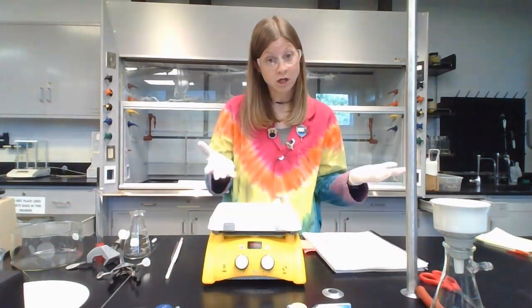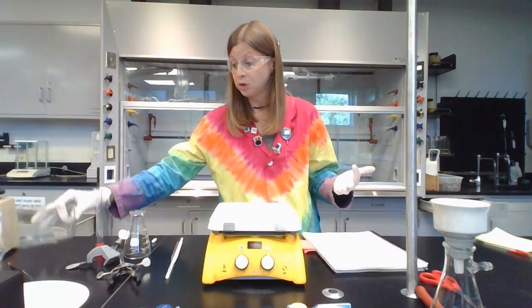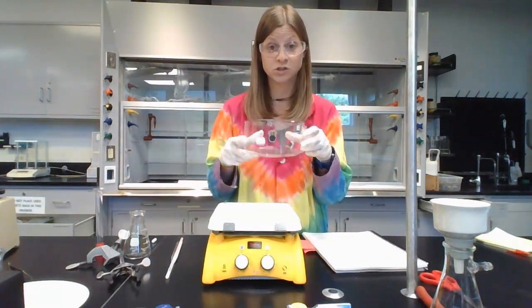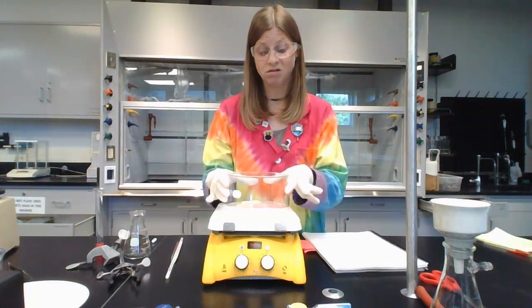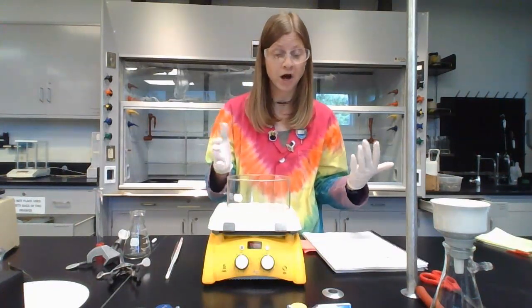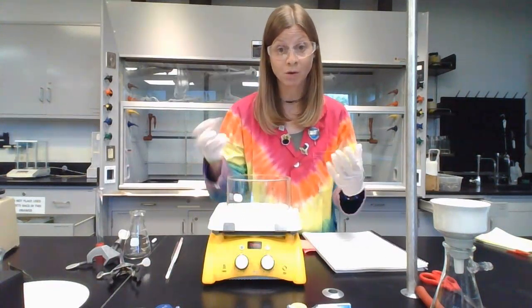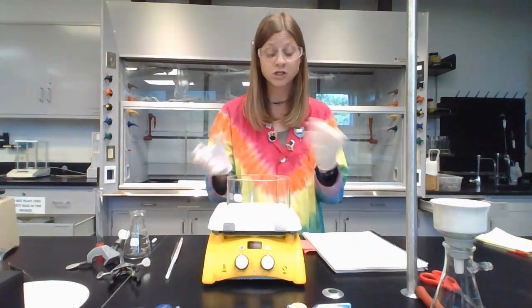So we're going to be starting by making a water bath using what's called a recrystallization dish. This is a piece of organic chemistry glassware. It's just a flat bottomed round thing. We're just going to fill it about halfway up with water. Tap water is fine. Its entire purpose is just to get warm so that we can dip other things in it. Okay, so you're going to start heating that.